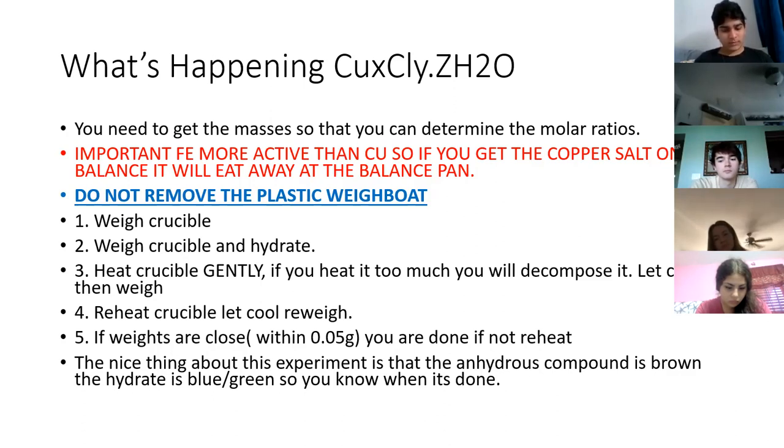Why did we reheat it? Why are we reheating the salt? To make sure all the water is out. If we get a consistent weight, that means that all the water has been driven off. Okay? We're done reheating now. Now we've just heated all the water out.